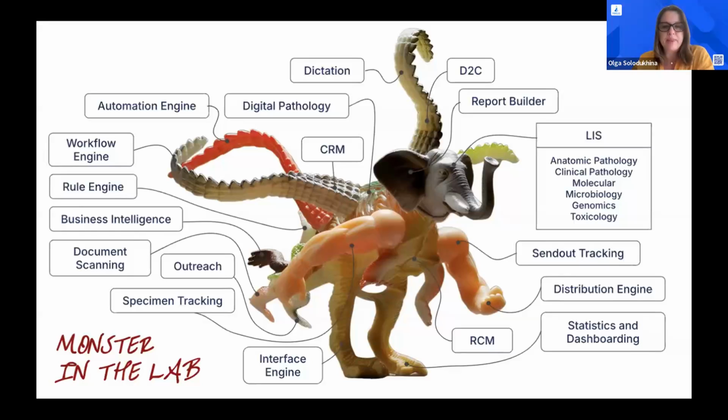One thing to remember is that as we service more than 300 labs in the US, every change we make for any type of lab, you get as well. So you benefit from us developing things for other labs. Keep in mind that we're a private company. We've been doing this for 18 years, and we're doing this only for labs.